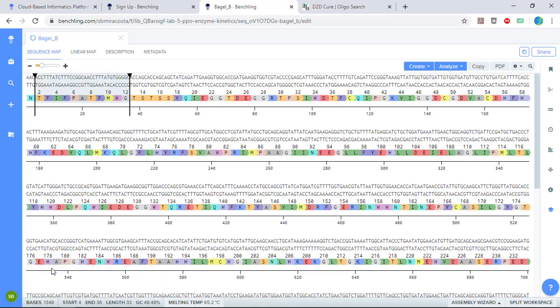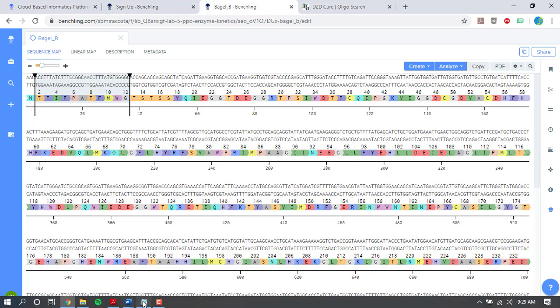The reverse complement is the bottom strand given right to left. By convention, DNA sequences are written left to right in the 5' to 3' direction, and this is how we will order our oligonucleotides. Since the top or sense strand of DNA is 5' to 3' from left to right, the bottom or antisense strand is 5' to 3' from right to left.